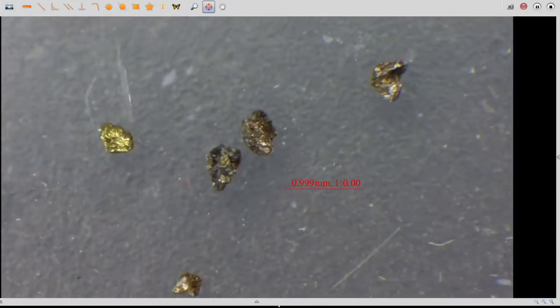Let me collect all sulfide grains in one place to show you how many of them we have liberated and concentrated with our 3D lab, with our technology.